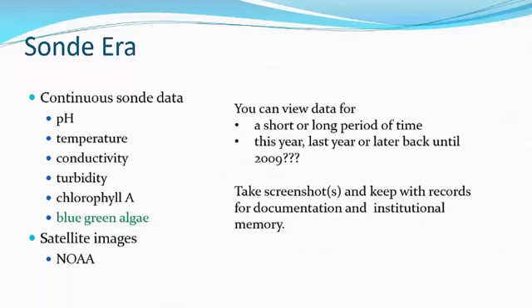One of the nice things about the sonde, as I'll show you here in a few minutes, is you can look at your data. You can go into the websites that the sondes report to, and you can look at your data over a period of time. You can download it, you can archive it, you can take a screenshot of the computer if you want to, you can make graphs. It gives you a lot of information.